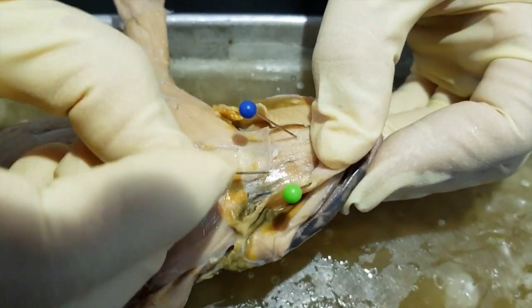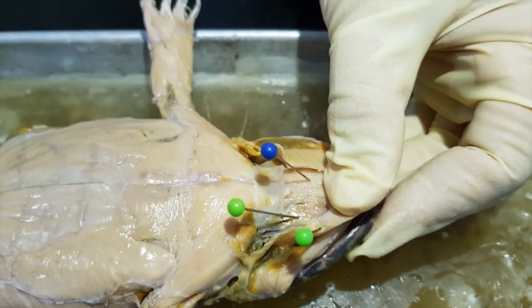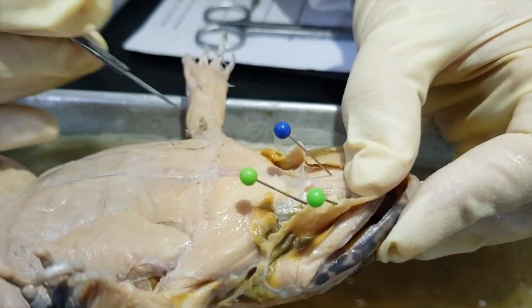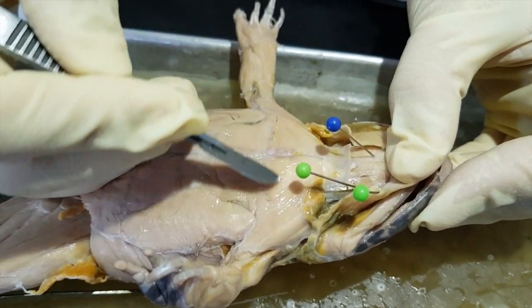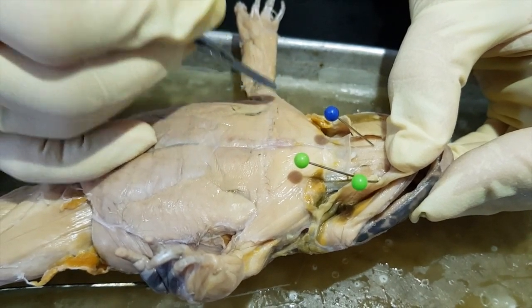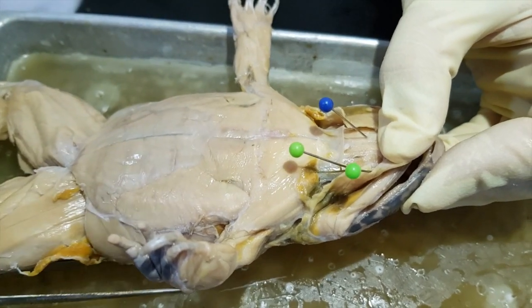Okay, a very thin muscle just like the mylohyoid is the geniohyoid. Okay, then as you go down posterior caudal, this is the previously identified deltoid, and there's a muscle that runs from the radial side to the sternum, the sternoradialis.